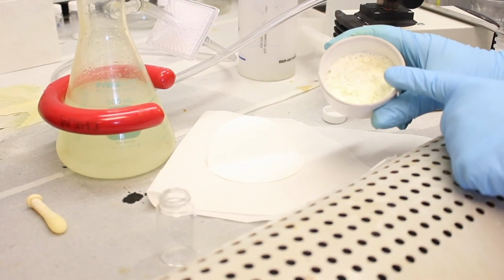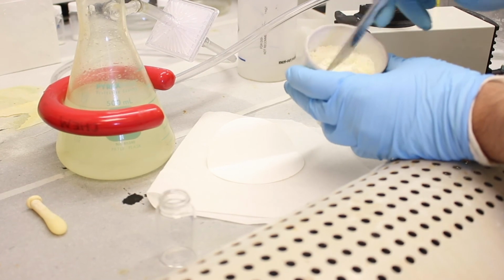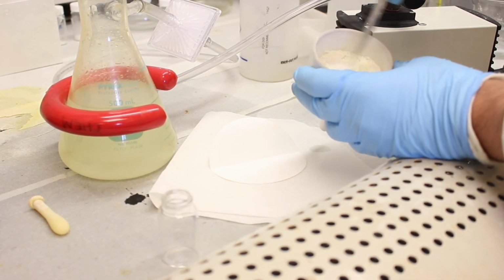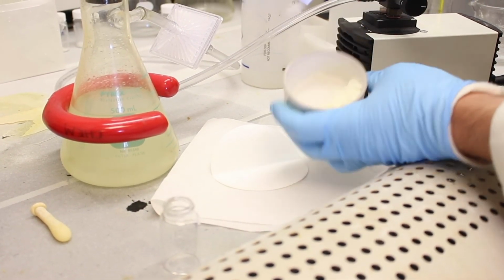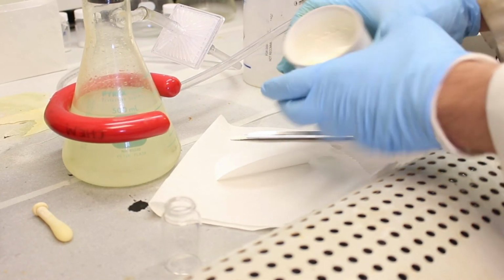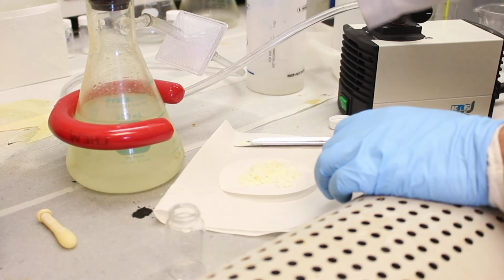So we've got our solid here, which has been drying on the filter for a little bit. Now we're going to try to get it out. It's a nice fluffy off-white powder. So hopefully we'll get a big yield here. That part's a little pasty. That's okay. Okay, so we can just take that.